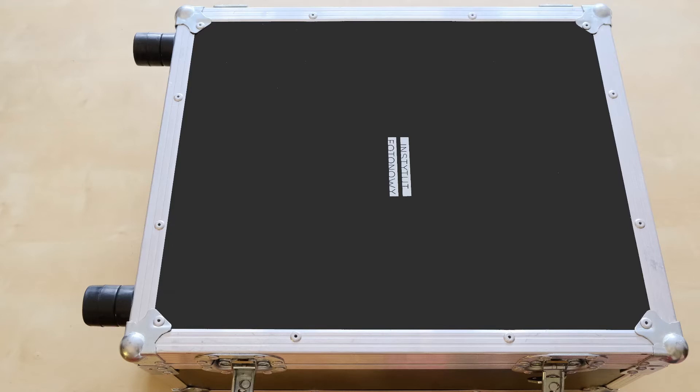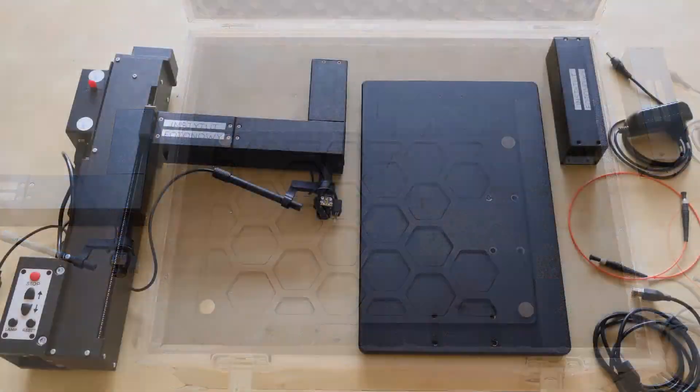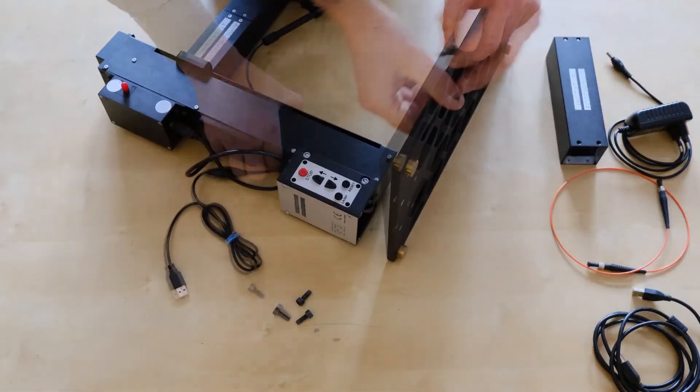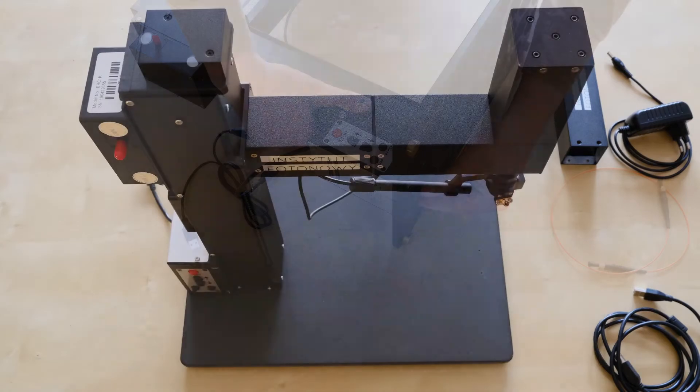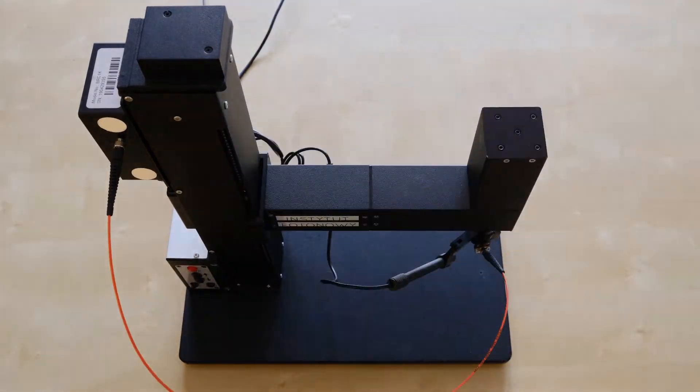The tool is portable. It is delivered with a transport suitcase. It can be assembled and ready for operation in approximately five minutes.